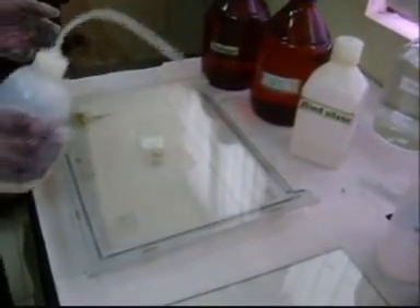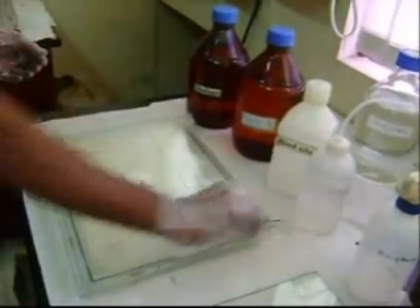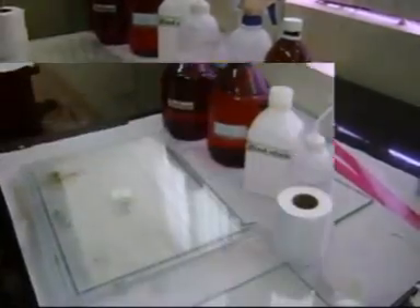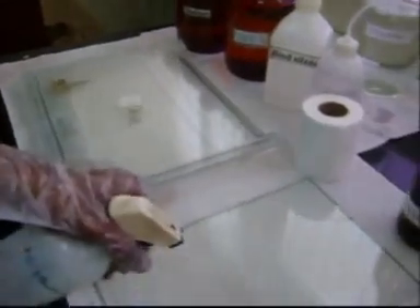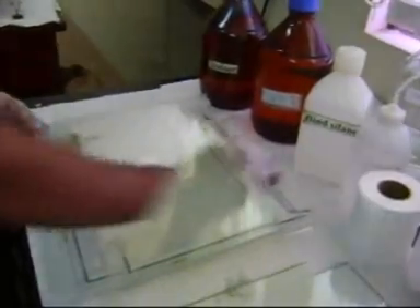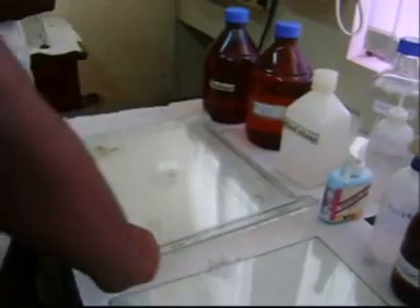Let's see the washing of the notch plate. Distilled water is applied on the notch plate and with the help of tissue paper, wipe it properly. Then apply 70% ethanol on both the notch plate and glass plate and wipe properly. Then apply the gel repellent on the surface of the notch plate and with the help of tissue paper, wipe it so that a layer forms upon the notch plate.